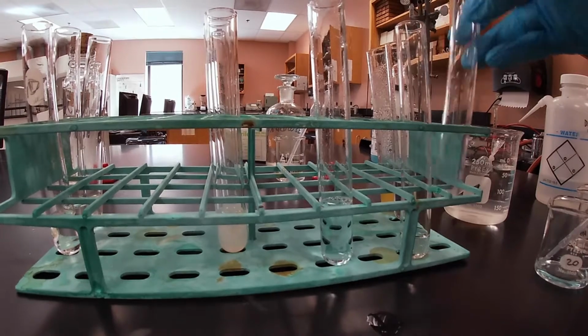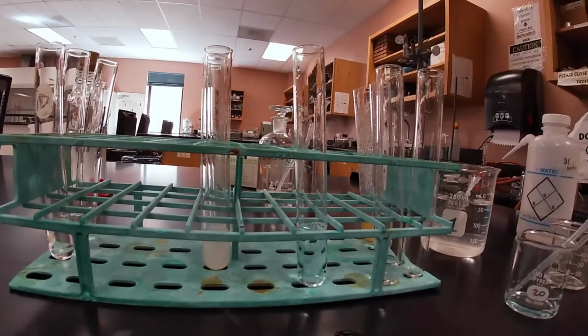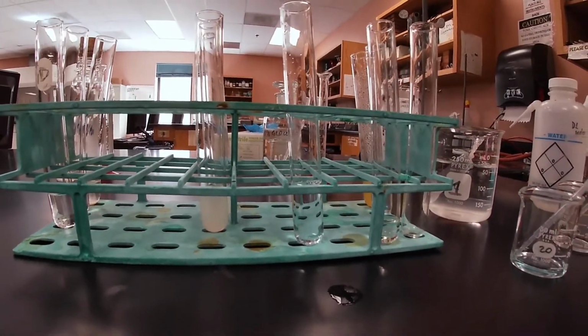Okay, now that I added my Benedict solution, we're gonna go over to our bath, and we're gonna put it into the boiling water bath for about 5 minutes.